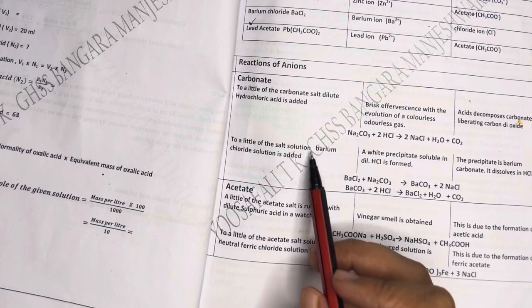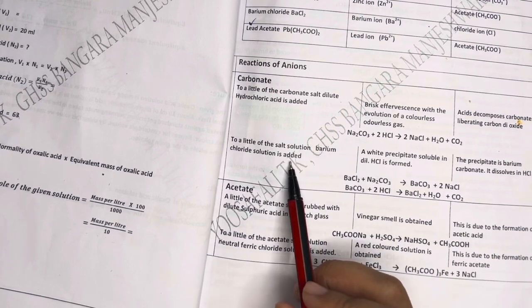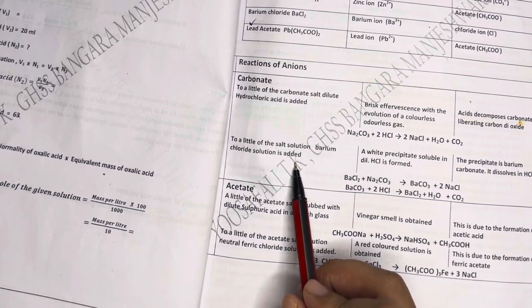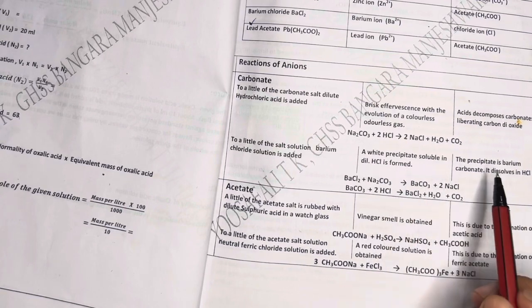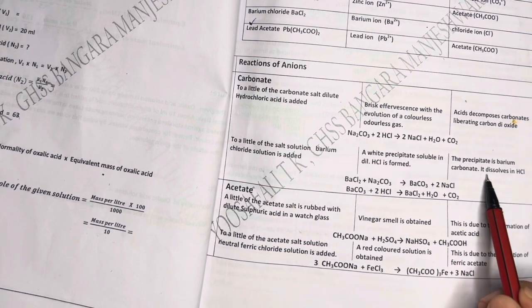And again, the next confirmatory test is to a little of the salt solution, barium chloride is added. So we have to add barium chloride to this little of the salt solution. A white precipitate which is soluble in dilute HCl is formed, which confirms carbonate. This is the confirmatory test for the carbonate.